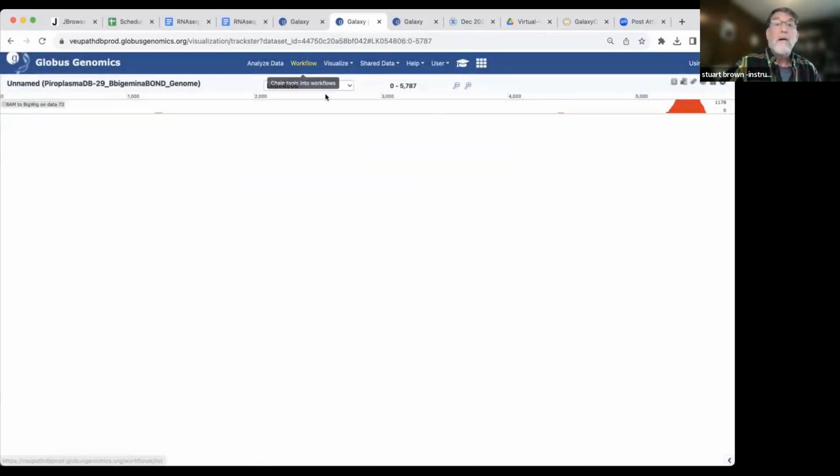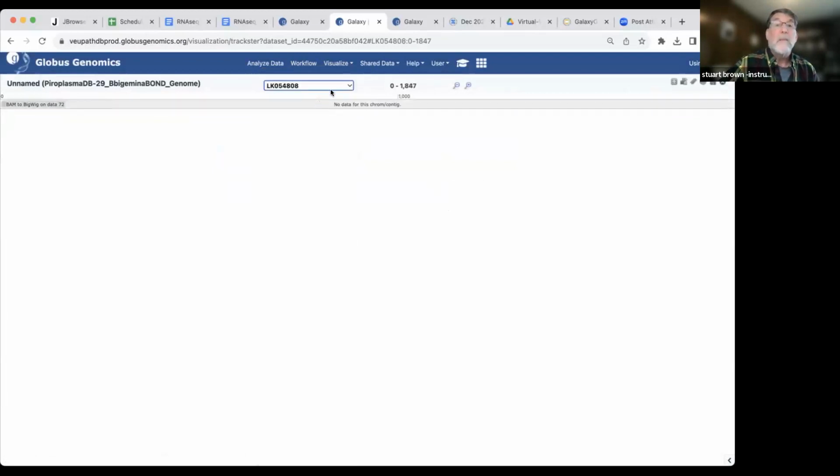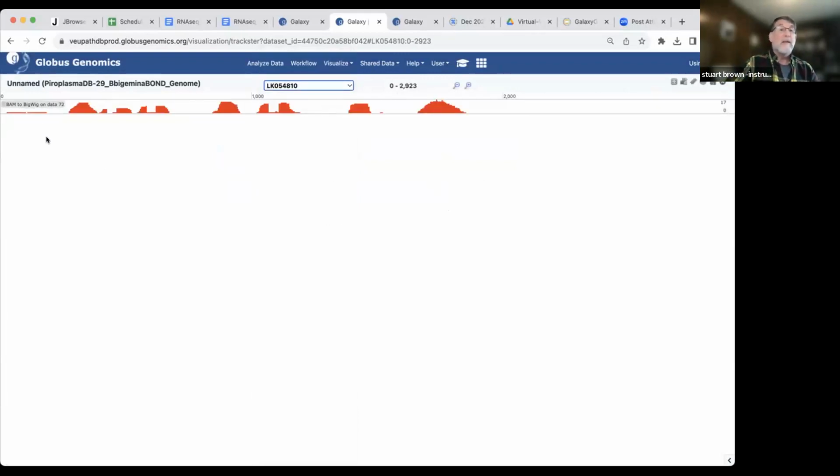And it loads the histogram for this particular chromosome. If you pick a chromosome that has good genes on it, you'll get to see the histograms. Unfortunately, it doesn't load the GFF file, so you can't look at the RNA reads with respect to where the gene names and exons are annotated.